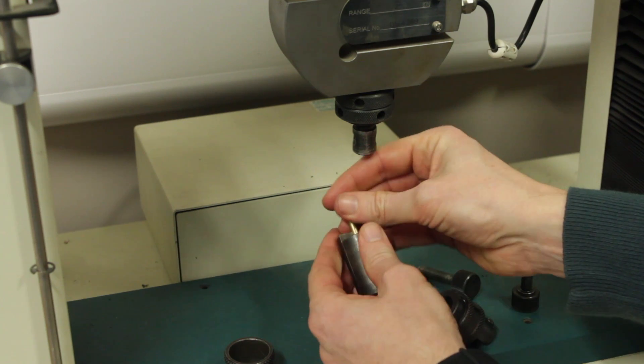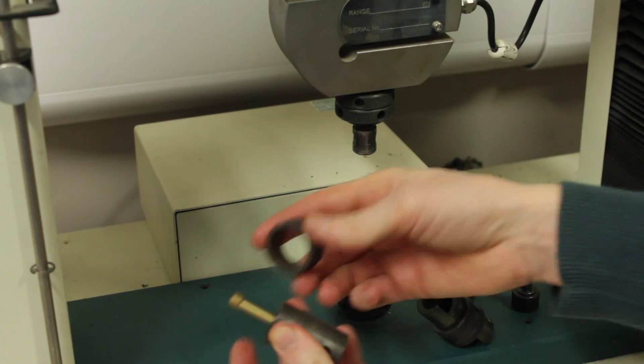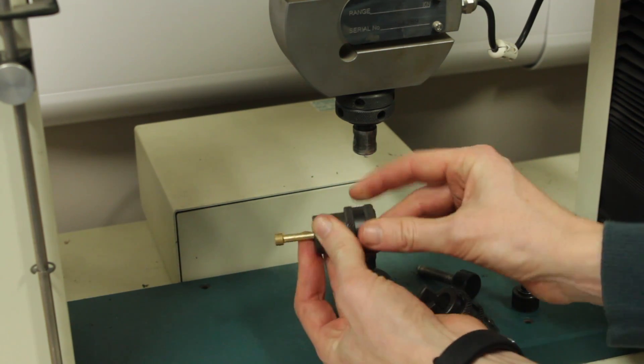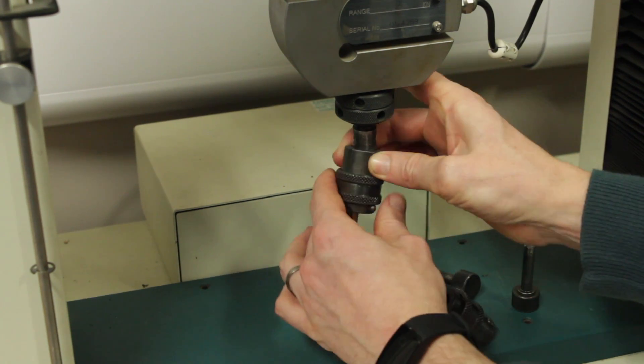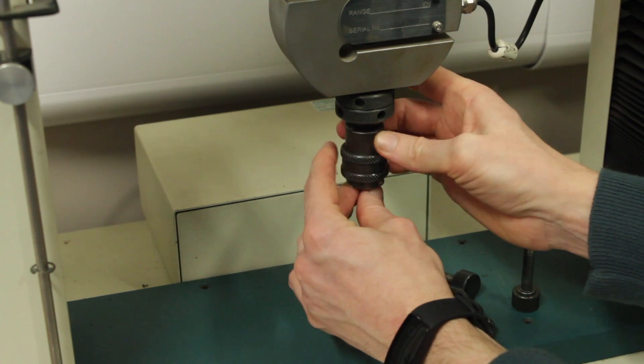Next we need to install one of the tensile test specimens. To do this, install the collet, add the collet ring and secure this entire assembly to the top stanchion by means of the pin.